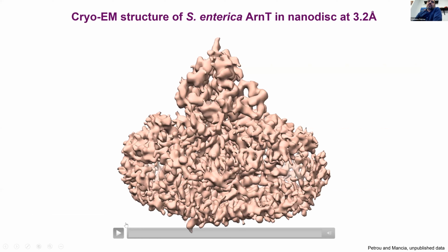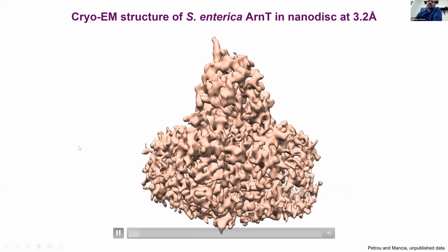So I'm going to show you here essentially the reconstruction. We're going to start off with low contours, so you see actually the nanodisc densities.